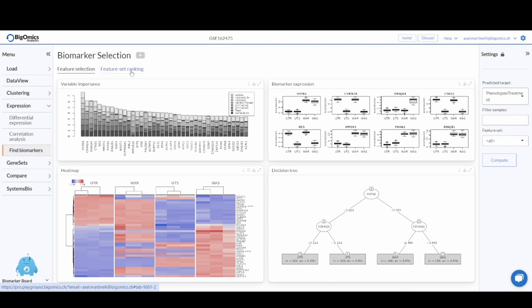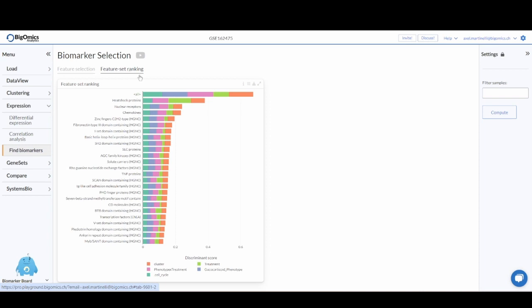The second tab that we have in our module is the Feature Set Ranking tab. In this tab, you can see the genes come split by gene families.